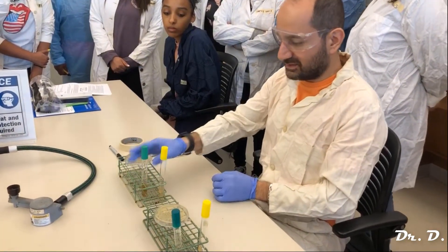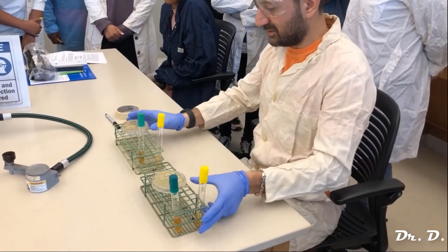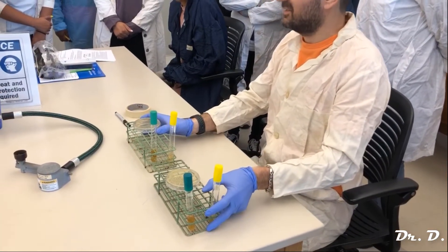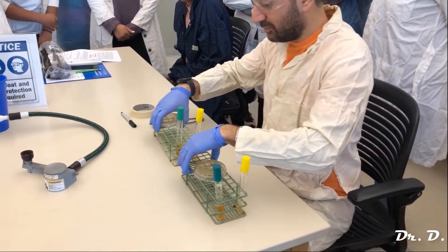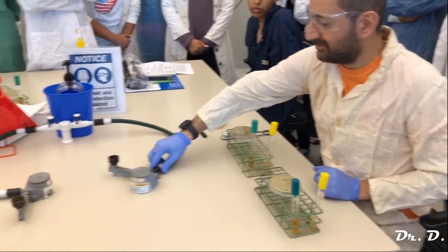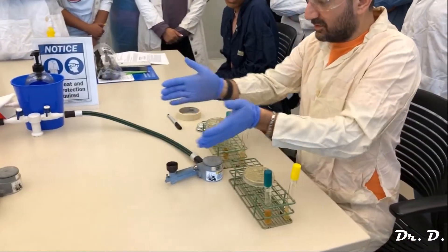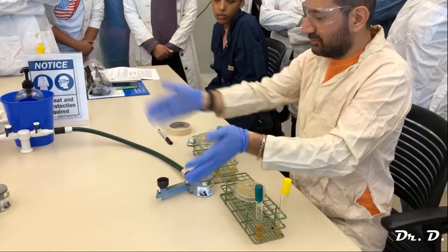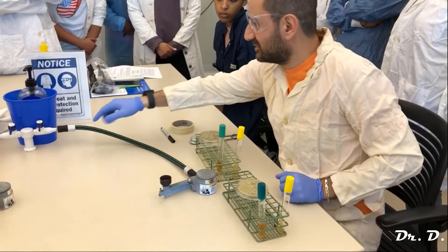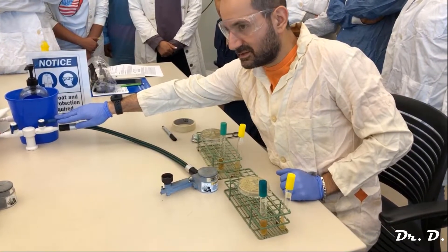Aseptic technique is the proper way of taking bacteria from one source and depositing it on another — it's called inoculating. We're going to inoculate fresh media. When you do aseptic technique, you always have to work near a flame, because there's an area around the flame that is relatively sterile — dust and everything moves away from that area.